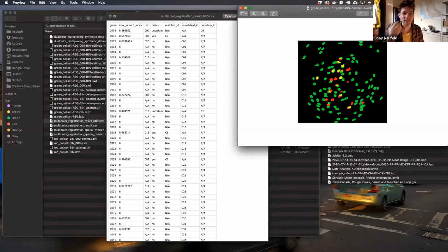Well, one of the special features of IDPS is that the image visualizer cannot display multiple colors. And so we're a little bit hooped right now. It looks the same, like you can't tell. Yeah, we can't visualize the red, yellow, and the other one, green. We can only do one color. We're getting around that with pseudo colors, but that's still one color being layered on top.